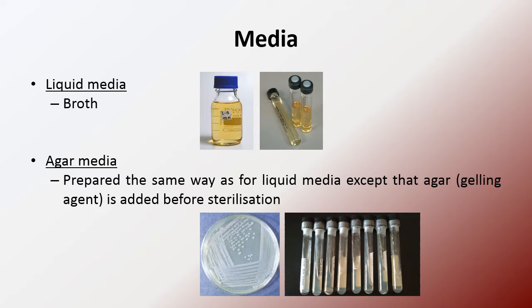The media can be divided into liquid and agar media. Liquid media, also called broth, is present in a liquid form. On the other hand, agar media is prepared the same way as liquid media, except agar is added. Agar is a gelling agent. After you add the agar, we plate it, or you can also put it in a test tube.